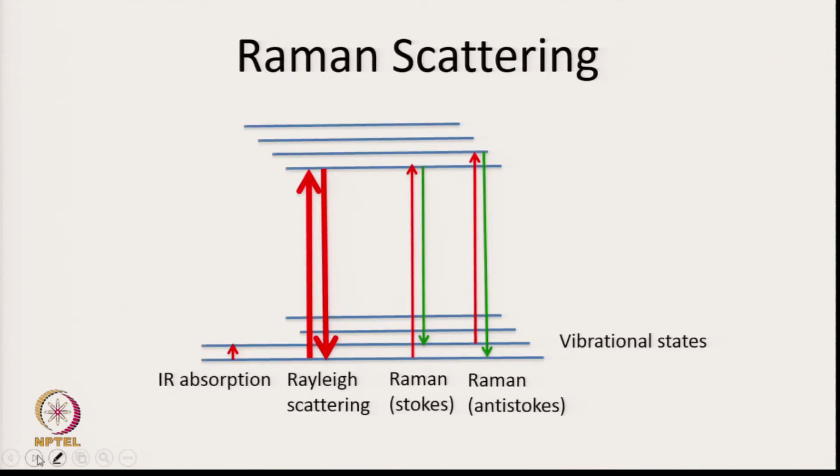So, what happens? What is happening in the sample? Let us look inside the sample at what is happening. These are the energy levels in a chemical compound. The lower ones are called the filled orbitals, and the upper ones are called the anti-bonding or unfilled orbitals. So, these splits which I have shown here to you are levels created by a vibration.